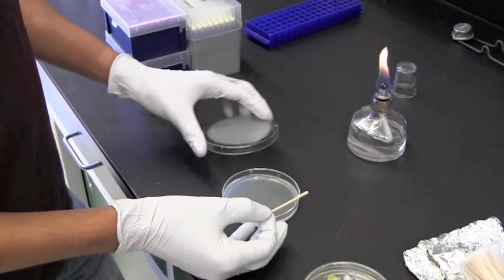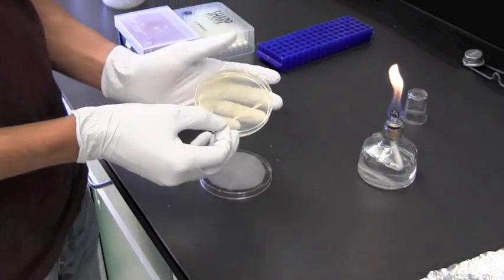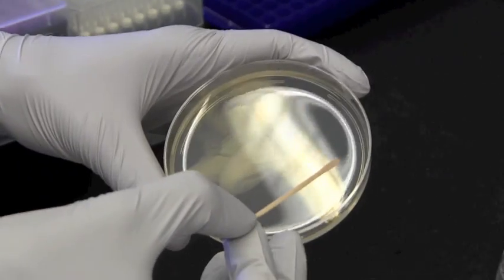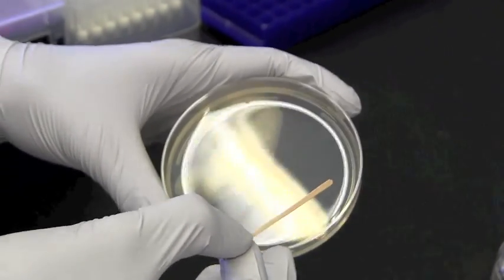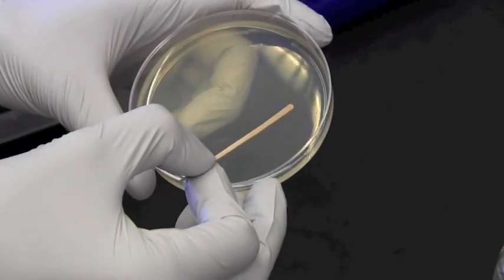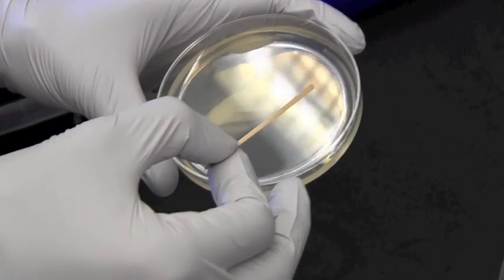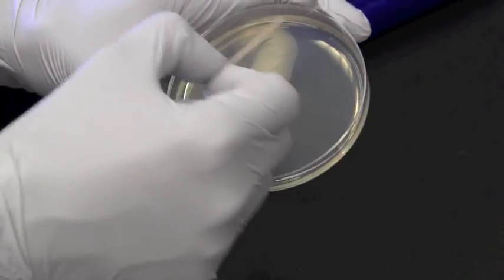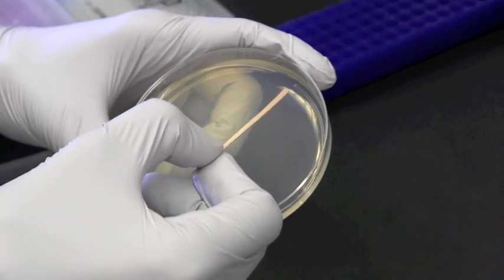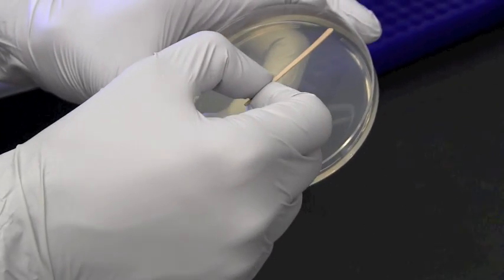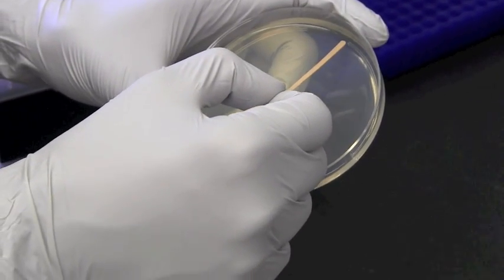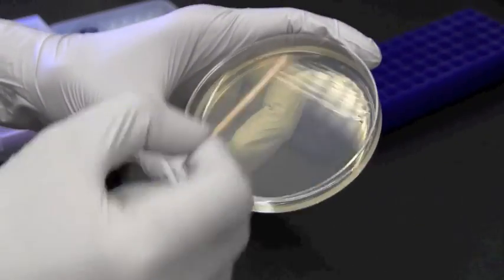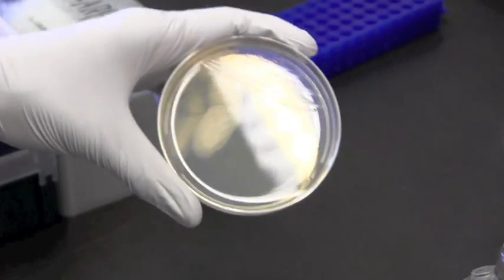So now we're going to pick up the plate slightly tilted and do our first streak out which is going to be the most concentrated smear of cells. What we're going to do is just scrape it onto the plate going back and forth in non-overlapping zigzag lines. And that's enough for our first streak.